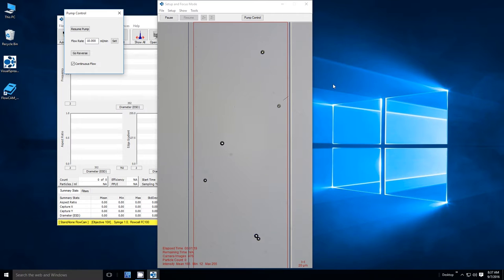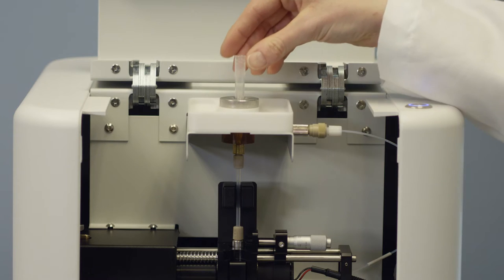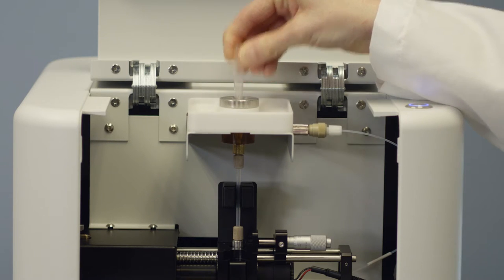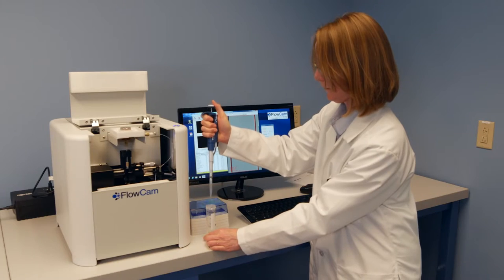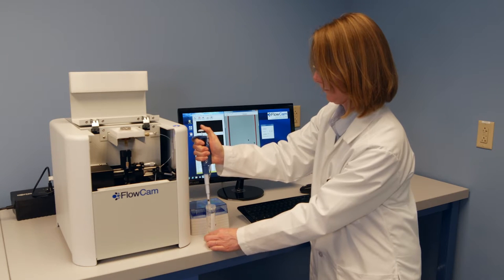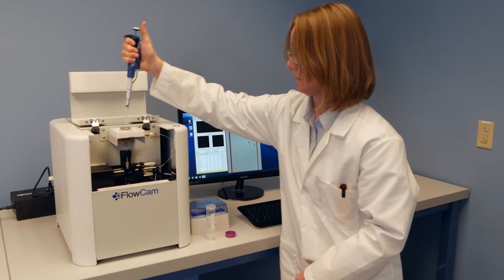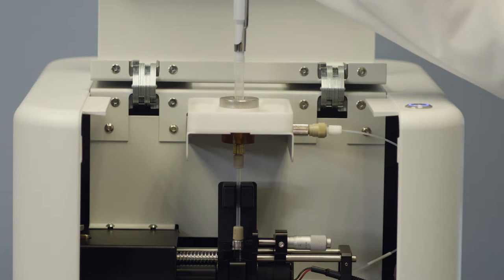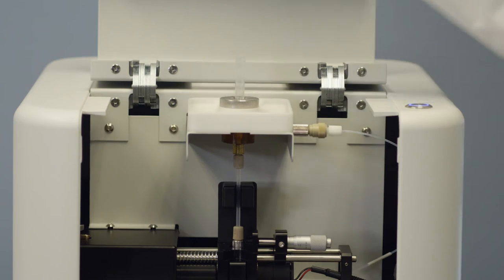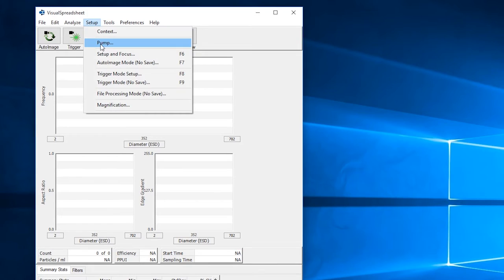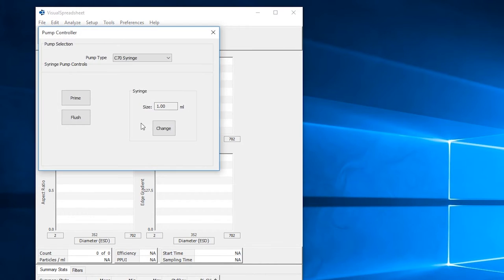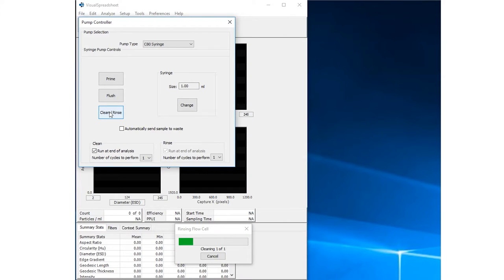After an optimum focus level has been achieved, the system should be flushed to remove any leftover focus particles. This can be achieved either manually by adding some cleanser and a new tip in the introduction port and utilizing the manual pump control in the setup and focus window, or by closing the setup window and utilizing the clean and rinse features located under setup pump.